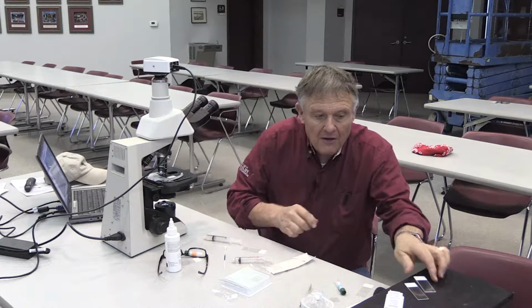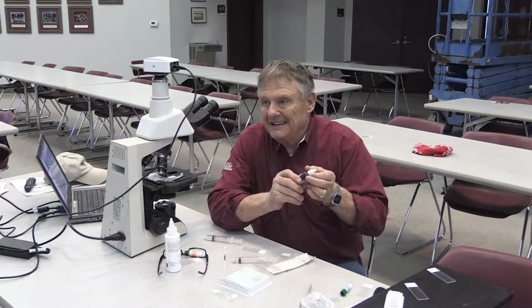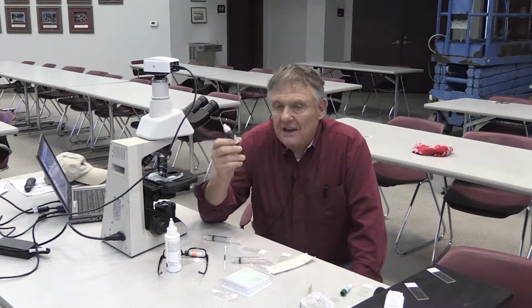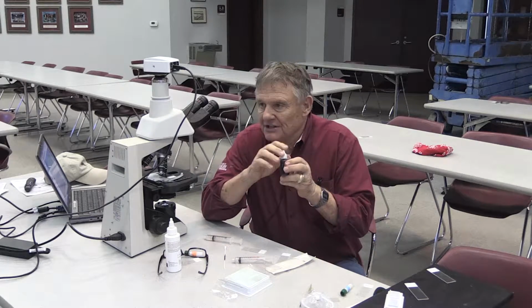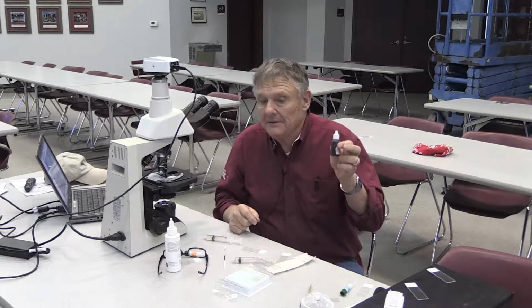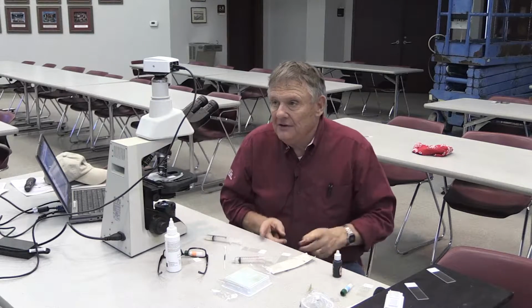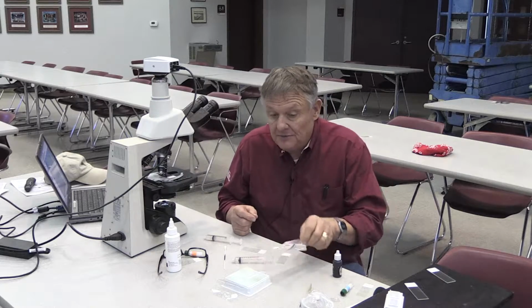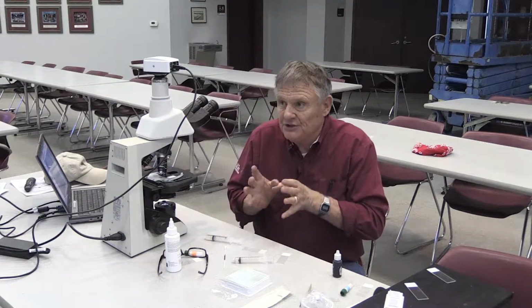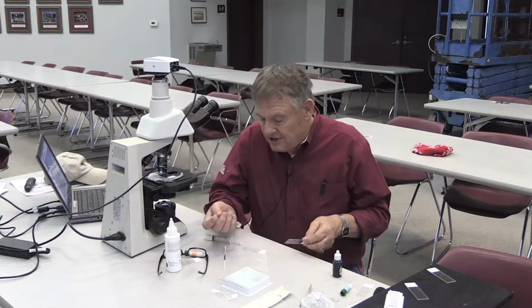Okay, now when we stain for morphology, we use a dye. I get this from the Society for Theriogenology. They're an organization that I belong to that set the standards for this in veterinary medicine. So I use their stain. You can use other stains; there are other commercial stains available. It used to be very popular, and you still could use it, a good grade of India ink, but you just need something where you can actually get a good stain on the semen.